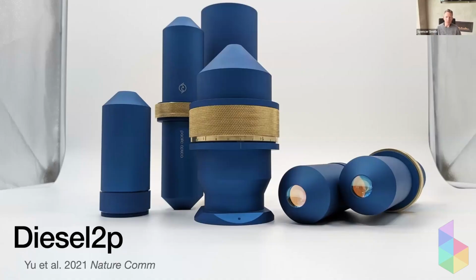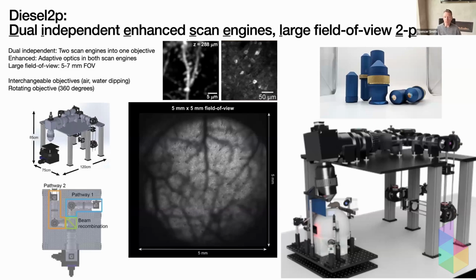So we can talk a little bit about the Diesel 2P if you're not familiar with it. Basically, it's one of these mesoscopes. So you've got submicron resolution in X and Y. It has a field of view of about 25 square millimeters. We actually went out to a span of 7 millimeters with adaptive optics at the edge to kind of squeeze out a bit more field of view.